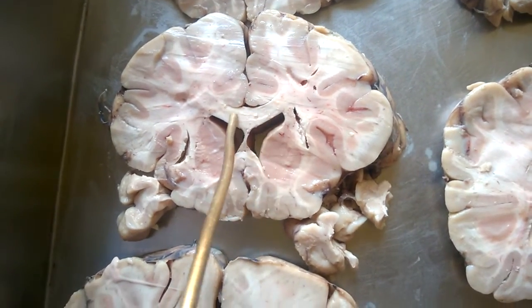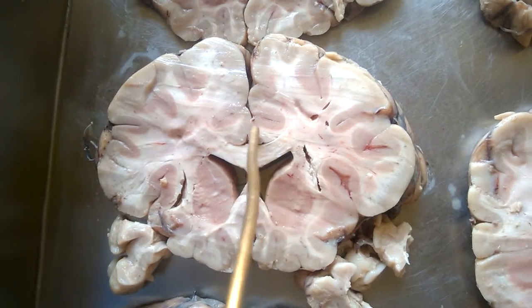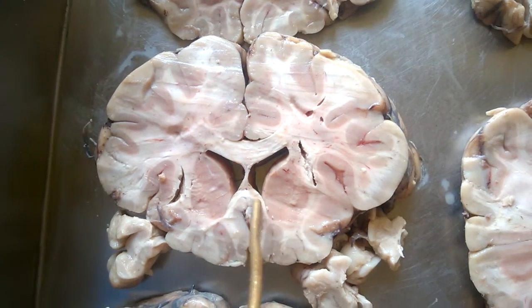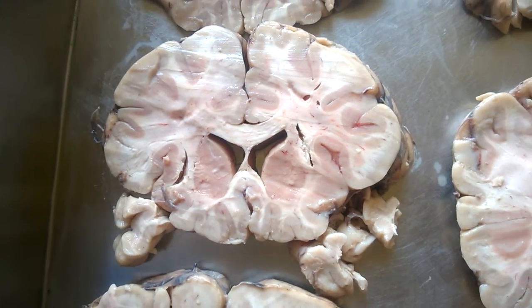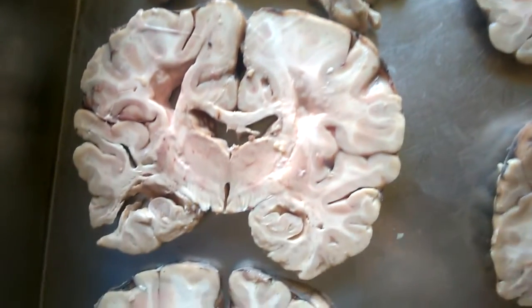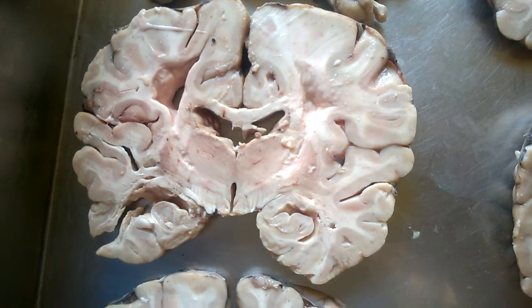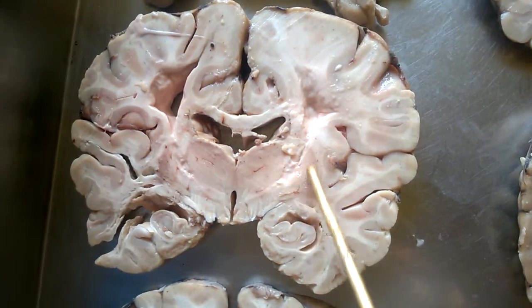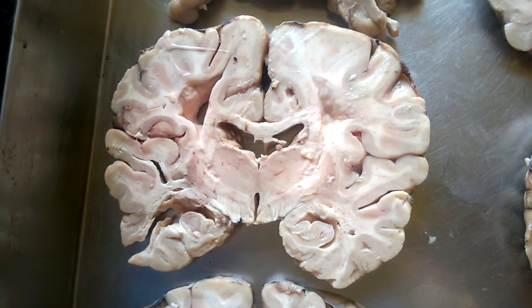This is the corpus callosum, cingulate gyrus, the septum pellucidum. This is the fornix, caudate nucleus, and coming down, we can see here the lenticular nucleus. The lenticular nucleus consists of the putamen and the globus pallidus. Together they are called the lenticular nucleus.